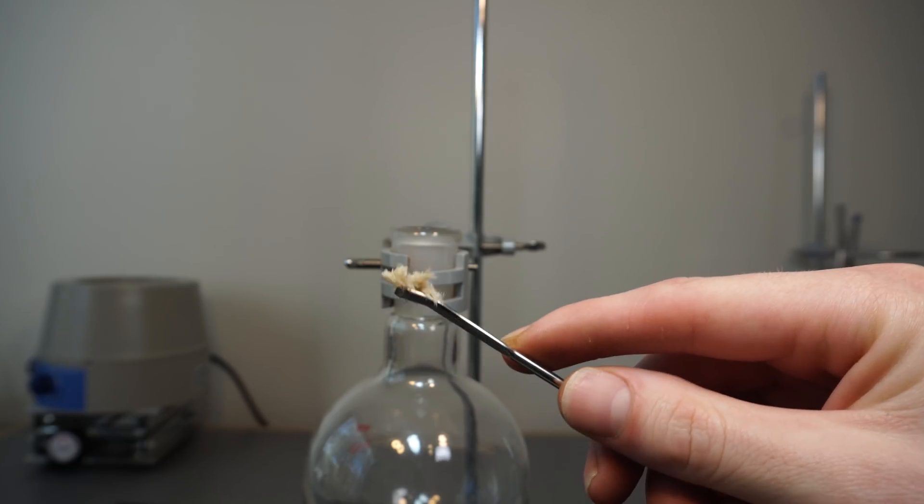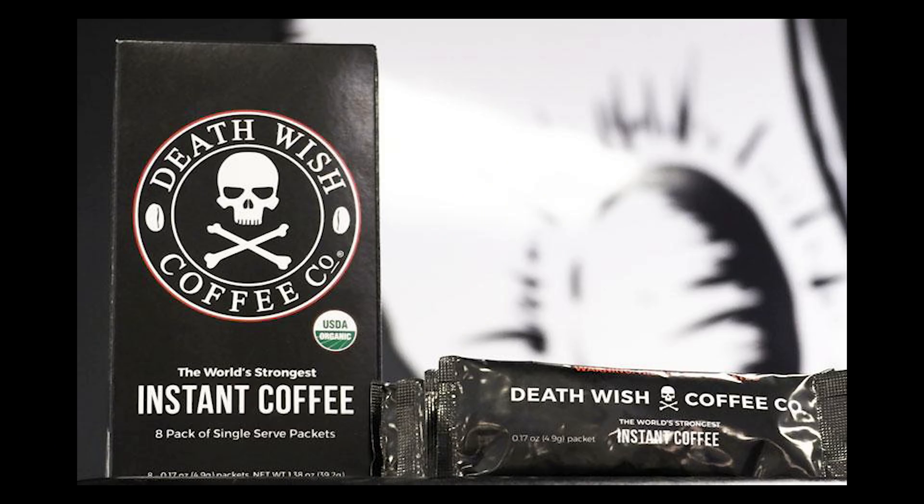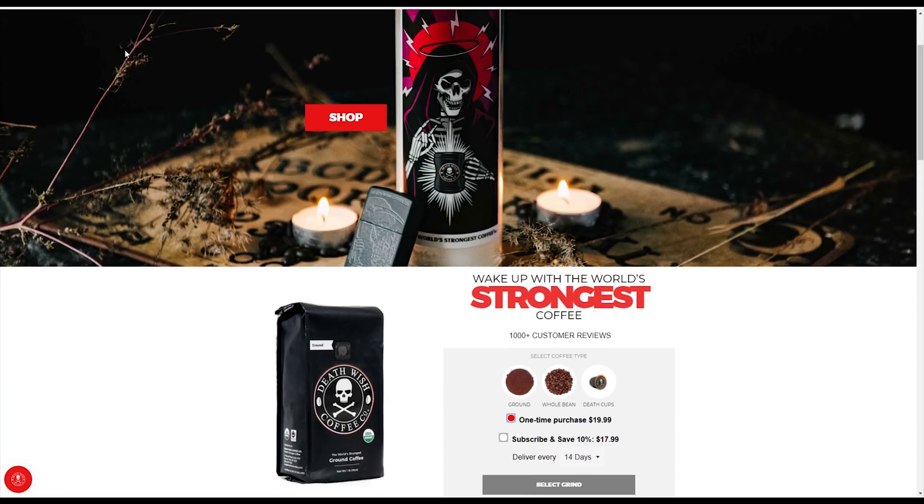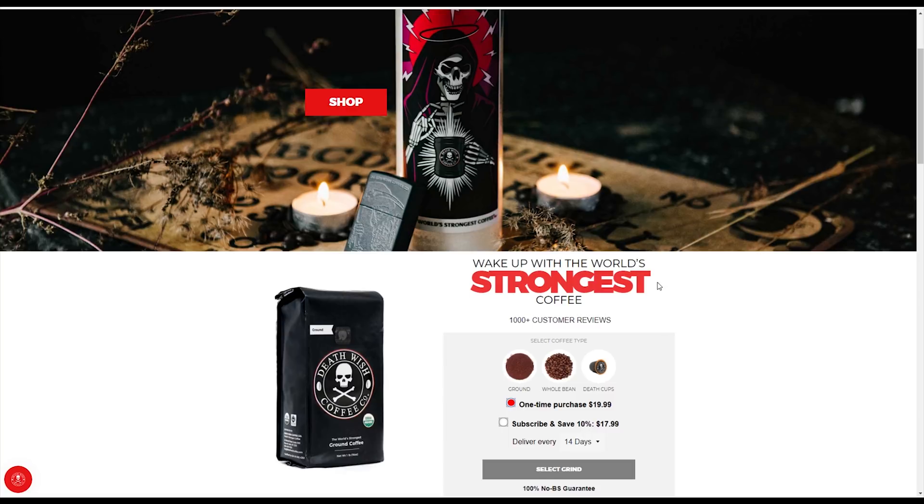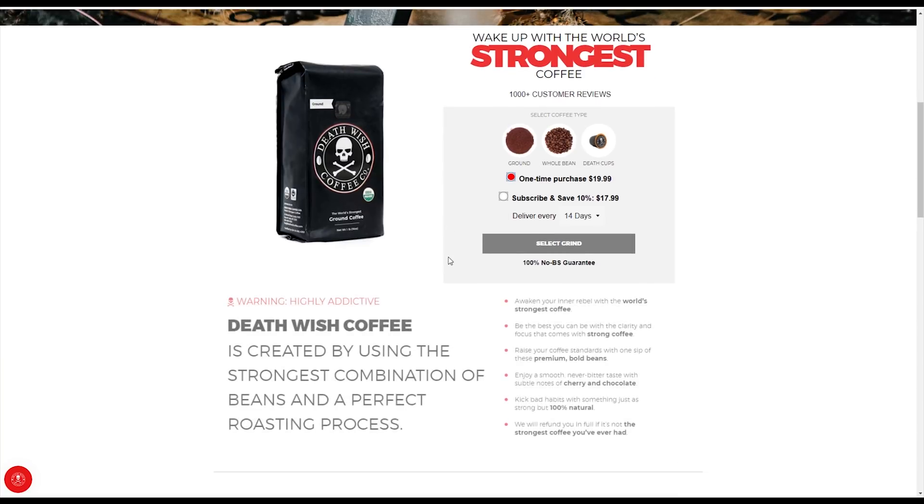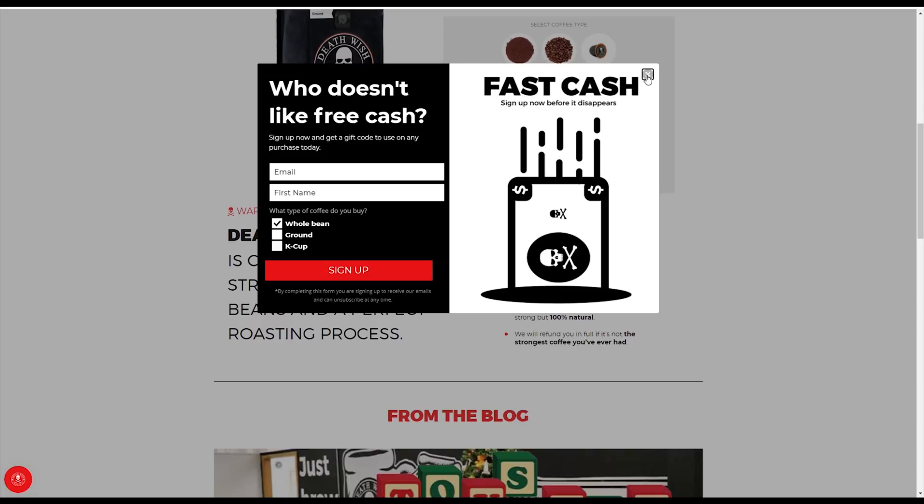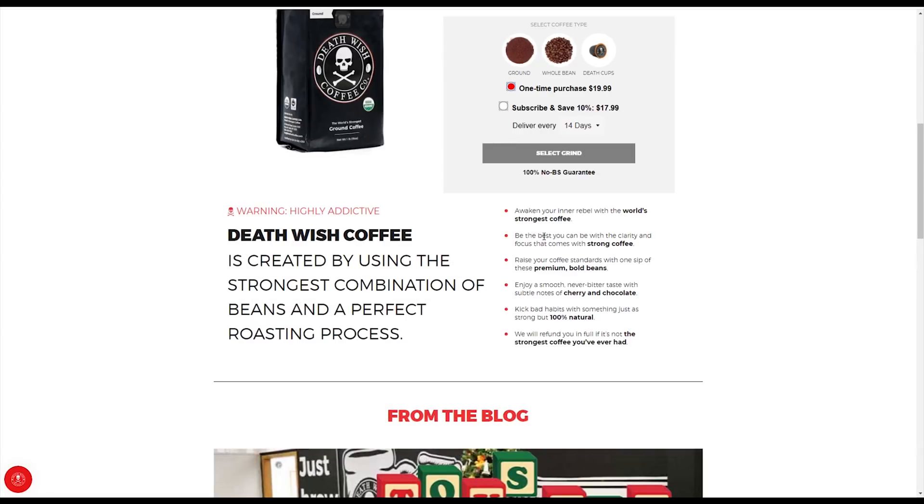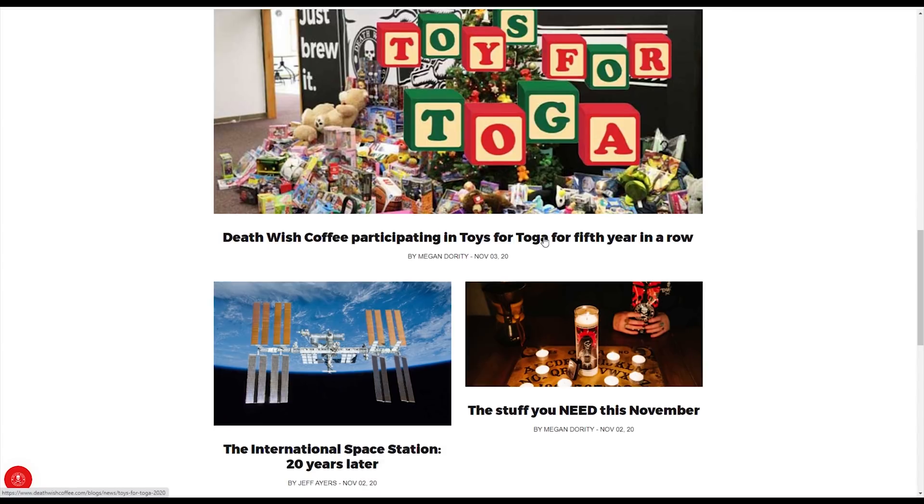Today I'm going to extract caffeine from Death Wish coffee, which is advertised to have more caffeine than any other blend. Though most people are pretty sure they just add extra caffeine to the bag. If this is the case, it's honestly ideal in this situation. So let's start our procedure.